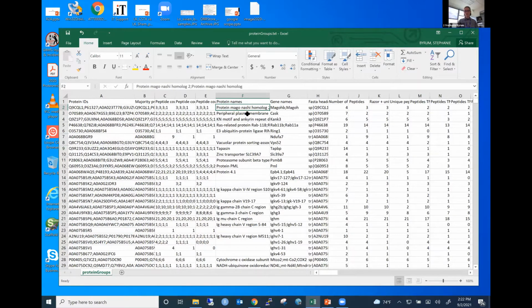So they're going to be a similar protein, but it can't necessarily distinguish between those two based on shared peptide information. So you can kind of run into that issue, and that becomes more of a problem when you're trying to do pathway type analyses later, which I'm hoping that we'll have a nice discussion on annotation and pathway stuff tomorrow. So yeah, we got that to look forward to.